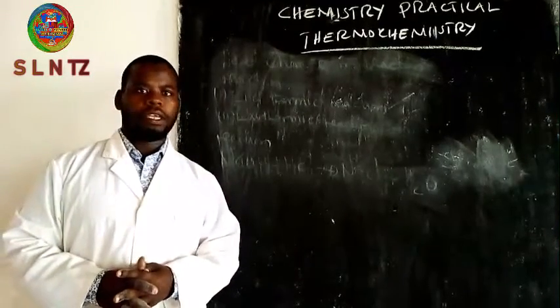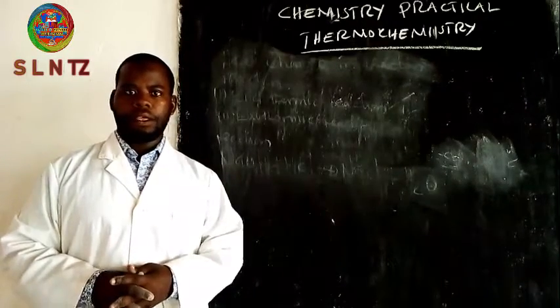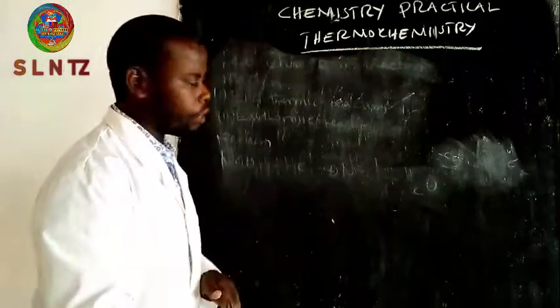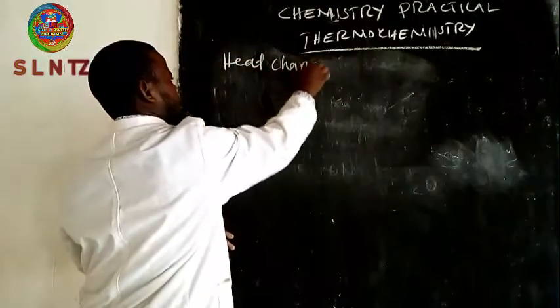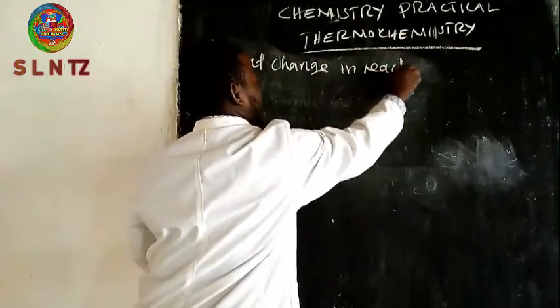Our topic today is thermochemistry. The main concept here is the heat change in reaction.